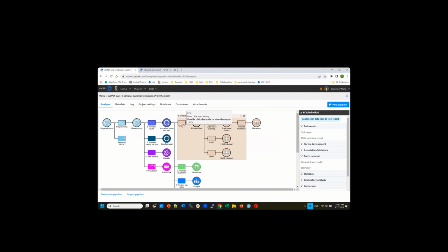When you visualize your data, if you have a big batch effect, it hides the biology, and you won't be able to discover the biology effect visually. So if that's the case, when you perform exploratory analysis with PCA on this data node, we have this option, split by sample.